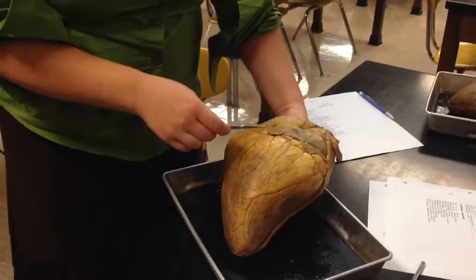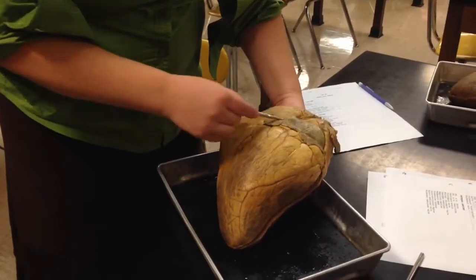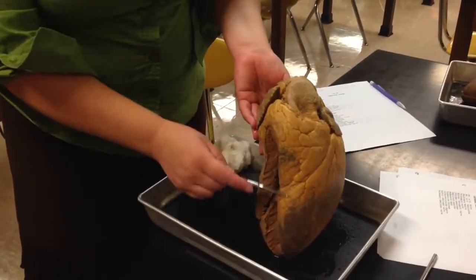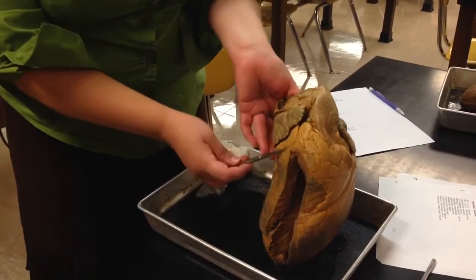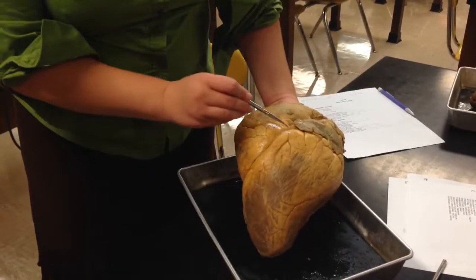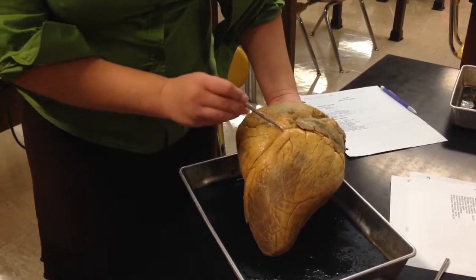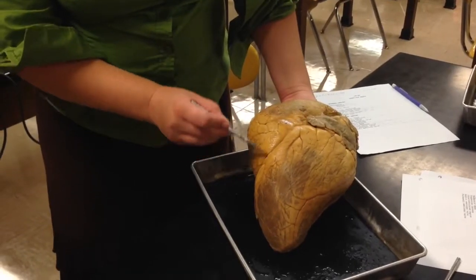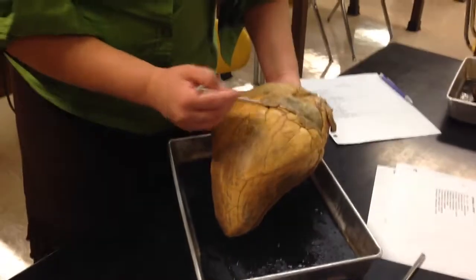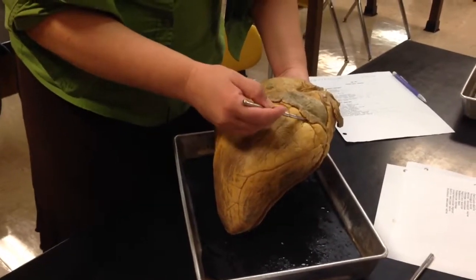At a cow's heart. This is the left atrium, left ventricle. This would be the right ventricle, and then back here is the right atrium. This groove that separates the ventricles is the interventricular sulcus. And between the atria and ventricles is the atrioventricular sulcus.